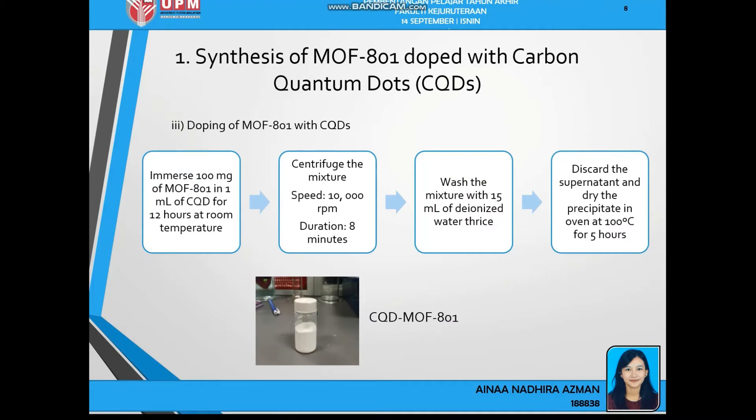Next is doping of MOF-801 with CQDs. The process is simple: immerse 100mg of MOF-801 in 1ml of CQD for 12 hours at room temperature. I upscaled the weight of MOF-801 and volume of CQDs to synthesize in bulk at once, maintaining the same 100mg to 1ml ratio. The mixture is then centrifuged at 10,000 rpm for 8 minutes, washed with 15ml of deionized water three times, and the precipitate is dried in an oven for 5 hours at 100°C to finally obtain CQD-MOF801. Physically, CQD-MOF801 looks the same as MOF-801 — both are white powder.